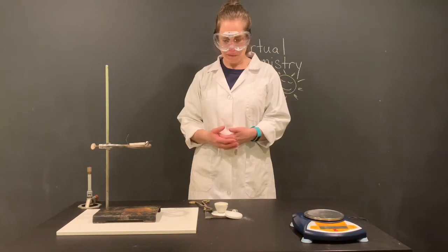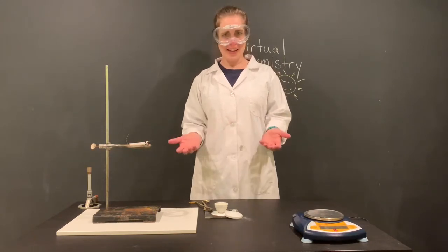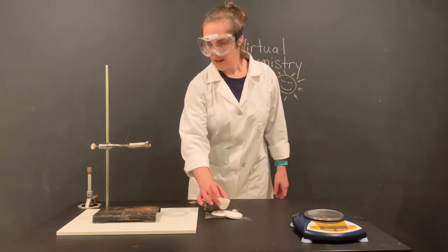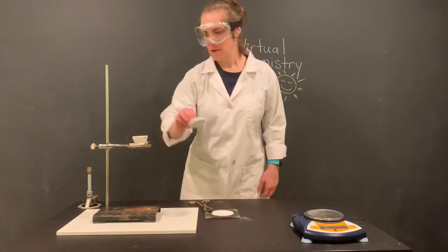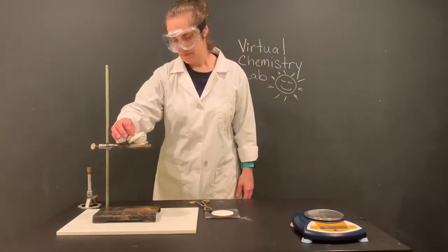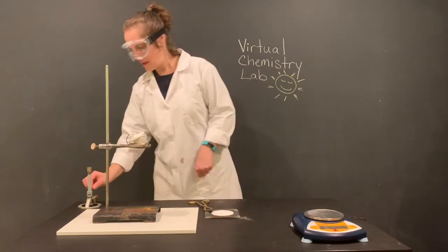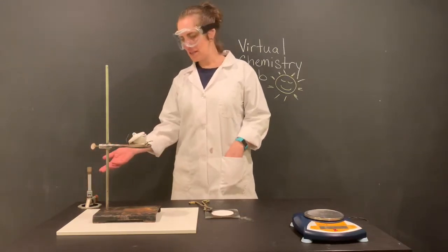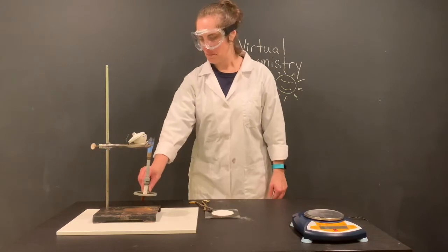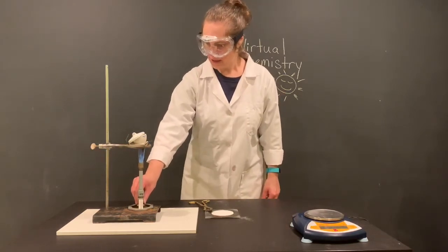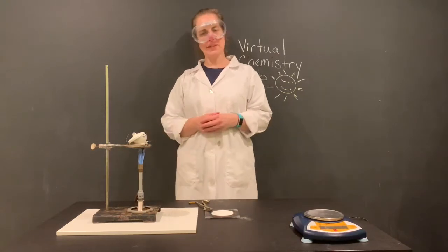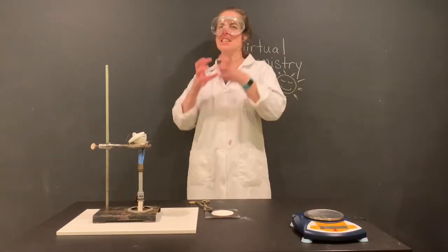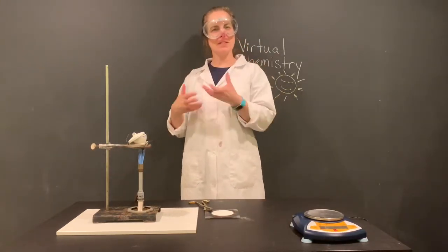Why? Well how do we know if it's done? So we're going to go ahead and put this back on there with our top. I'm going to get my Bunsen, light my Bunsen burner. I'm going to put my Bunsen burner underneath, and this time I'm going to let it heat up for about five minutes, because that initial heating probably drove most of the reaction.